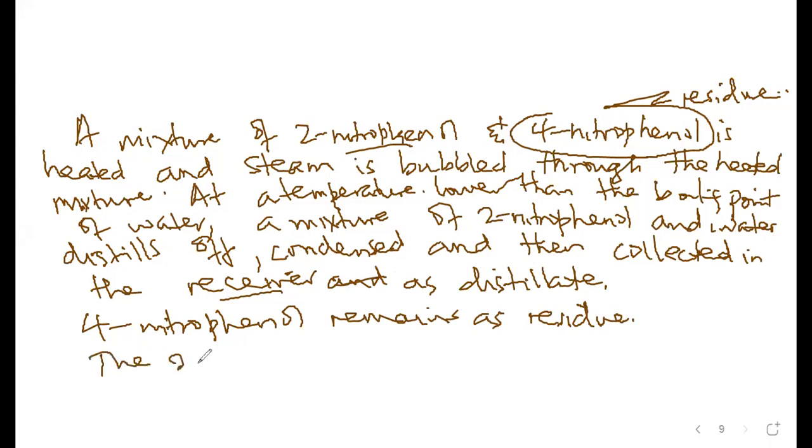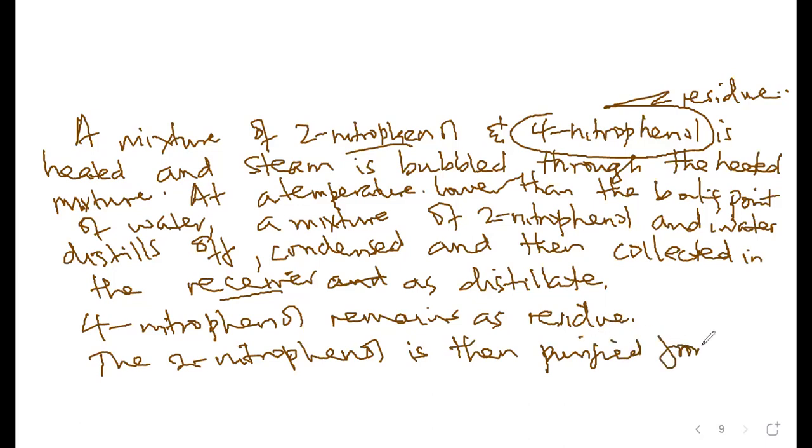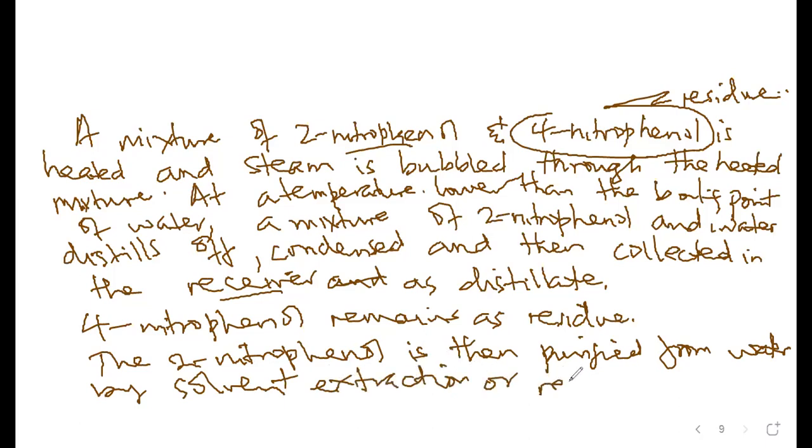Then you say the 2-nitrophenol is then purified from water, or collected from water, by solvent extraction, or removed using what?